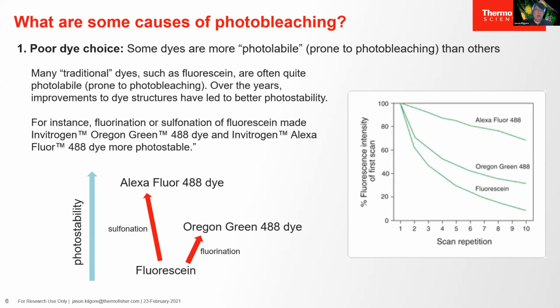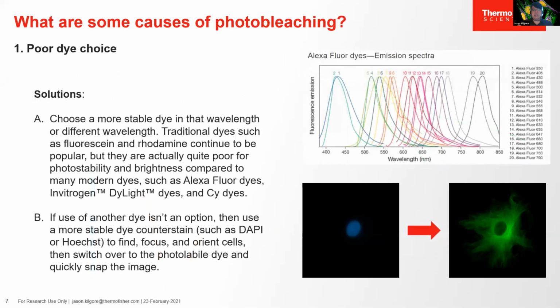And over the years, there have been dyes introduced by other companies too. Of course, I'm biased being from Molecular Probes, and we have those Alexa Fluors going from blue all the way up to near infrared. You can see some curves up there, but there are many good dyes out there, such as the DyLight dyes from Pierce, which is now part of Thermo Fisher. The Cy dyes that you're probably familiar with, Cy3, Cy5, Cy7, eFluor dyes.